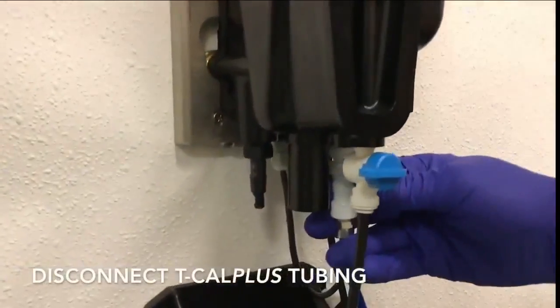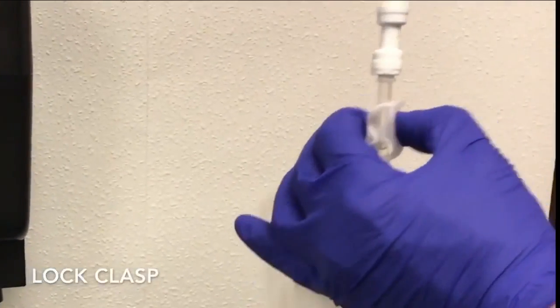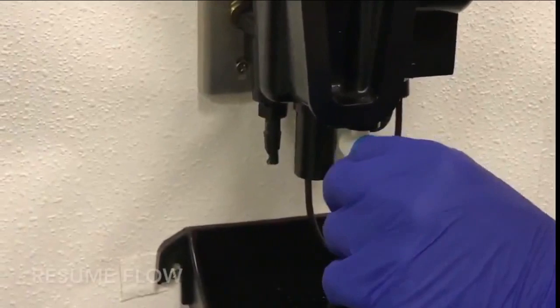From here, disconnect the TCAL Plus tubing, lock the tube clasp, and resume flow. You can properly dispose the used TCAL Plus standard by following your regulatory requirements for your area. Once rinsed, it is okay to reuse the calibration tube.